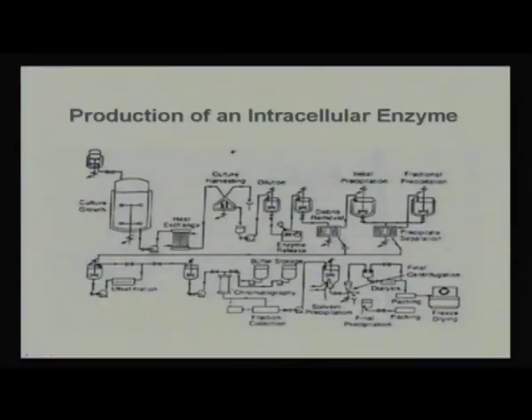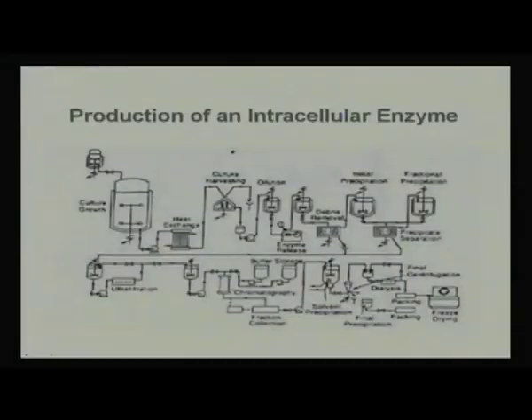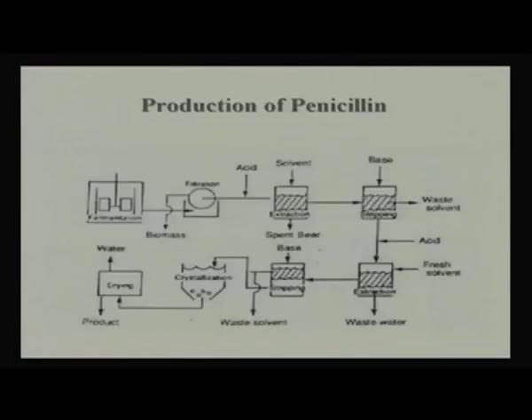See here, we have used each and every unit operation, starting from extraction, cell disruption, homogenization, centrifugation, ultrafiltration, precipitation, chromatographic techniques, and then ultimately we have lyophilized the final product. Each and every unit operation is needed for purifying this type of intracellular enzyme.